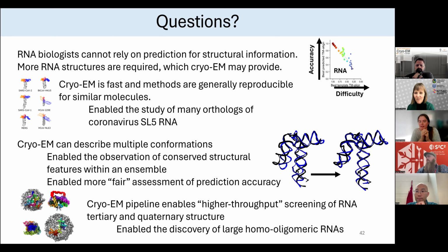And then when you're trying to differentiate conformations, because you're unconfident in whether it was a top or a side view, now you're getting orientation and conformation all mixed up. So I'd say for dynamic RNAs that are very large, I think we're already at the point that we can address those. But for small ones, I think we're going to have to get either improvements in engineering to get better signal to noise in our data, or improvements in the current computational methods to address that uncertainty.